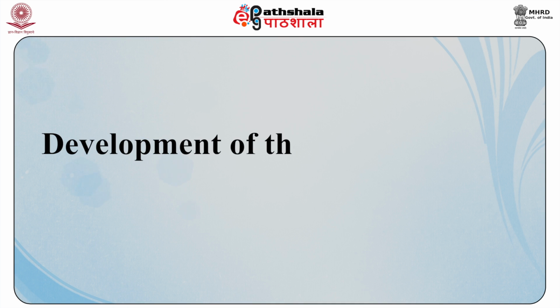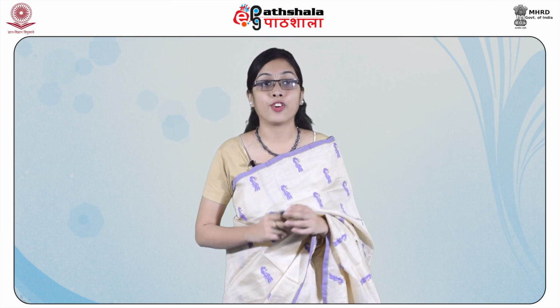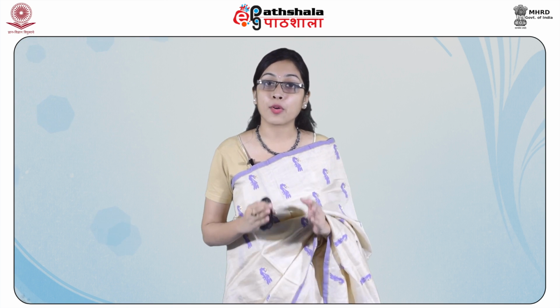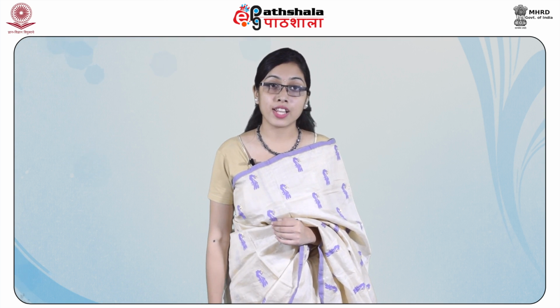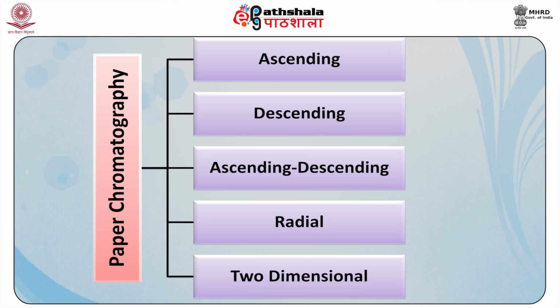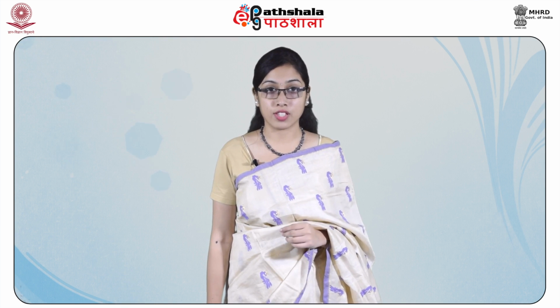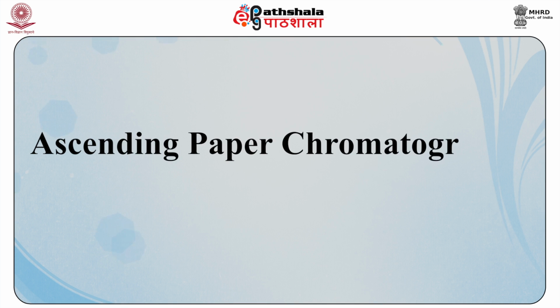The next step is the development of the chromatogram. After preparing the chamber and spotting the samples, the paper is ready for development. Depending upon the type of development, paper chromatography can be classified in several forms such as ascending paper chromatography, descending paper chromatography, ascending descending paper chromatography, radial chromatography and two-dimensional paper chromatography. Now, let us take one by one each of these. First is ascending paper chromatography.